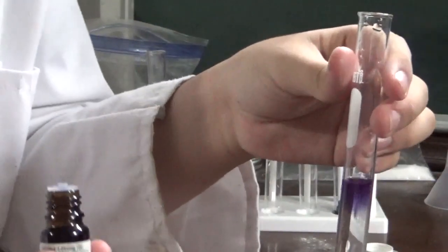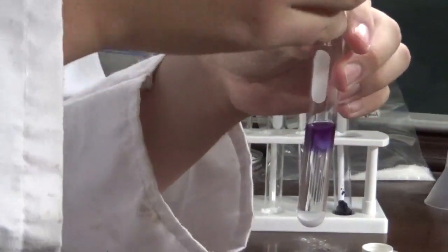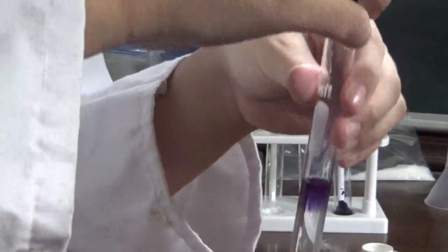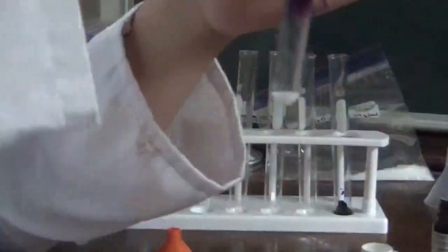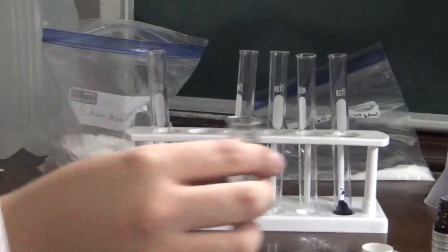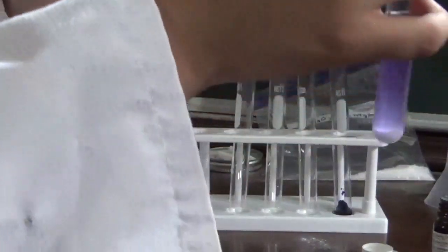There you go, a red solution. Now, there we go, I figured out how to use this bottle. So now if I add some litmus solution to this, simply tipping this over drop by drop.